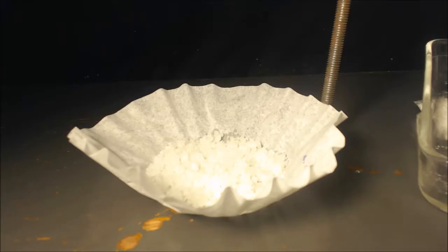But the reason why I got such a crappy yield was because I didn't put an ice bath under the pot when I was adding the ethanol, which was the very first step, and I didn't have my condenser elongated for the reflux and for adding, you know what I mean? I should add that longer than just a small condenser.